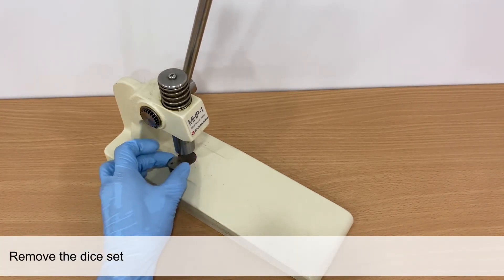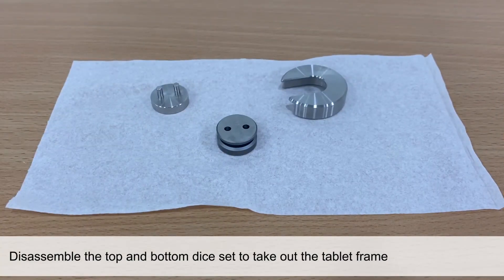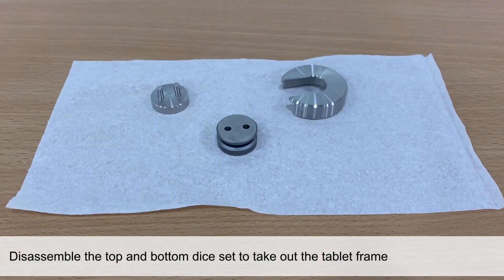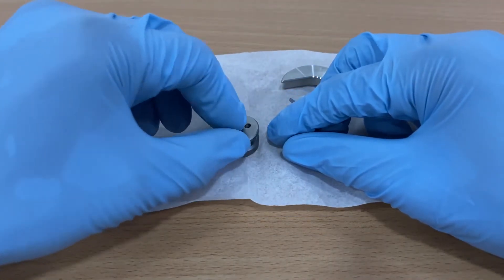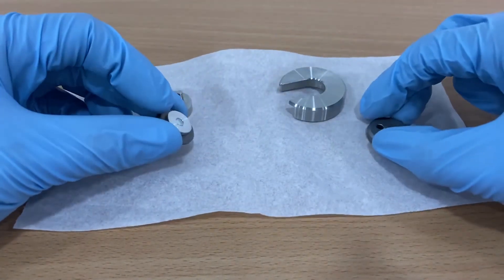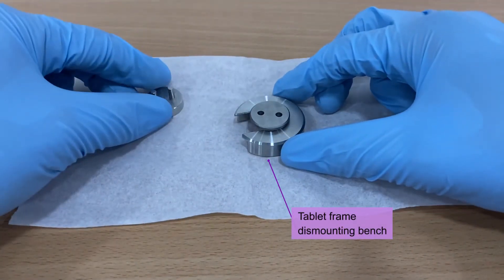Remove the dice set from the mini hand press. You can now disassemble the top and bottom dice set to take out the tablet frame. This can be done using the tablet frame dismounting bench and tablet frame dismounting tool.